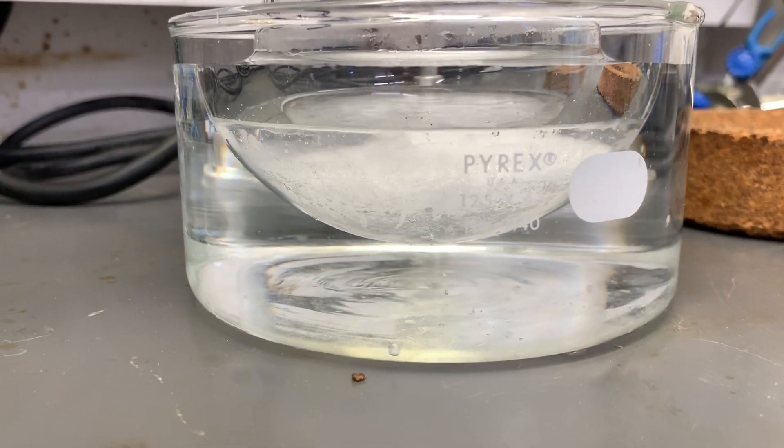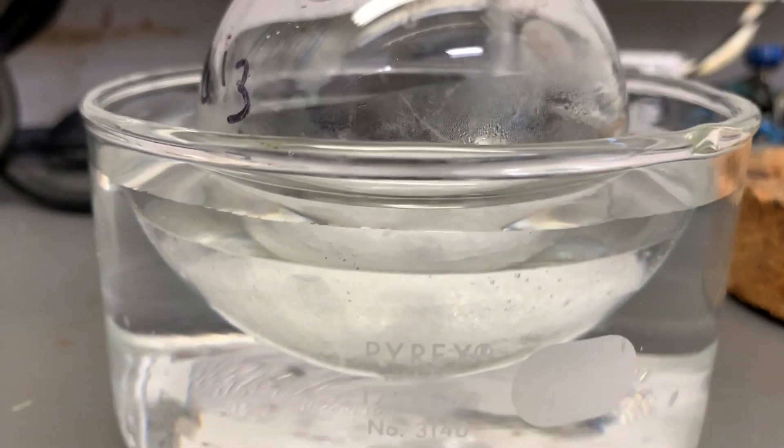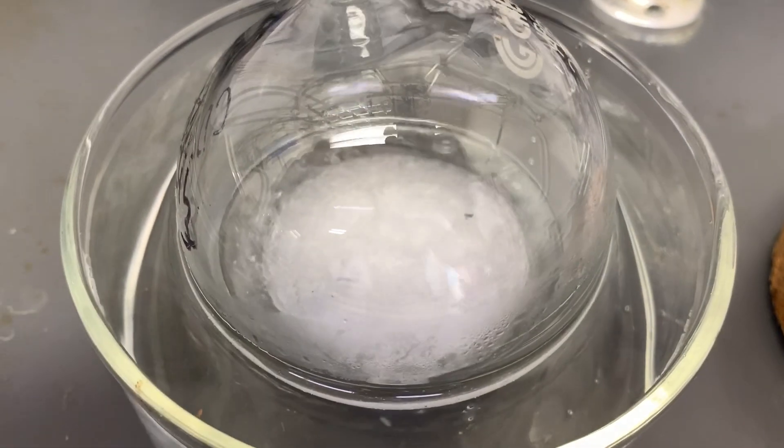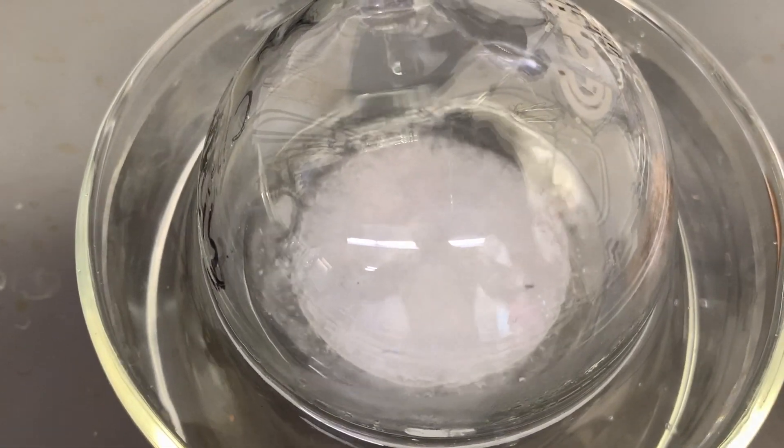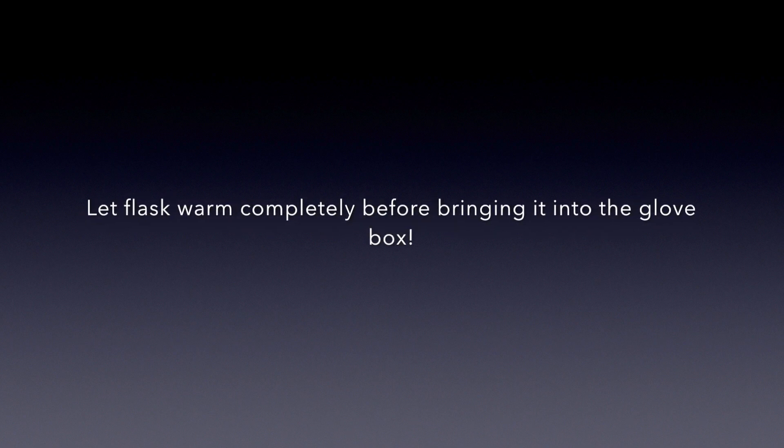Begin your second cycle by freezing your liquid in the liquid nitrogen Dewar once again. After three cycles, you have removed all dissolved gas and are ready to go. Just a quick note: if you are interested in bringing this liquid into the glove box, please let it warm completely so that there is no ice in the flask.